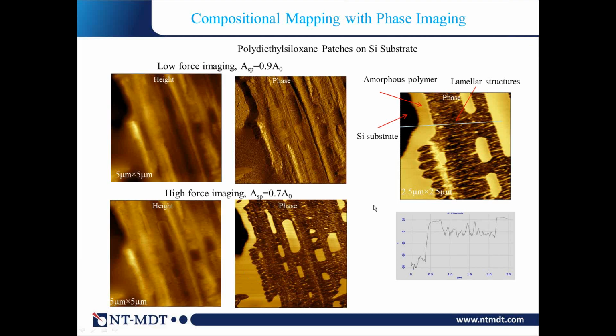Here I want to notice that different instruments represent the phase differently. In NT-MDT instruments, the bright color in the phase images, which is done at elevated forces where you go to the repulsive interaction range, typically corresponds to softer materials, and a darker color to the stiffer one.